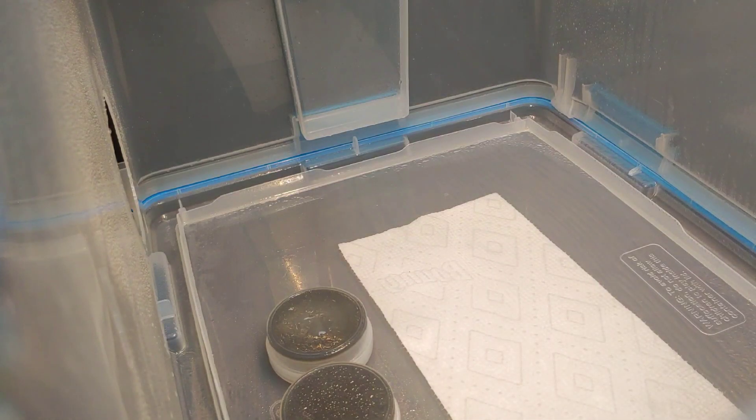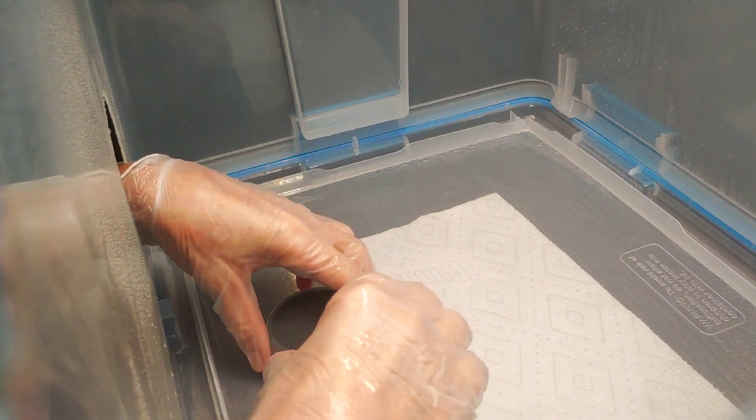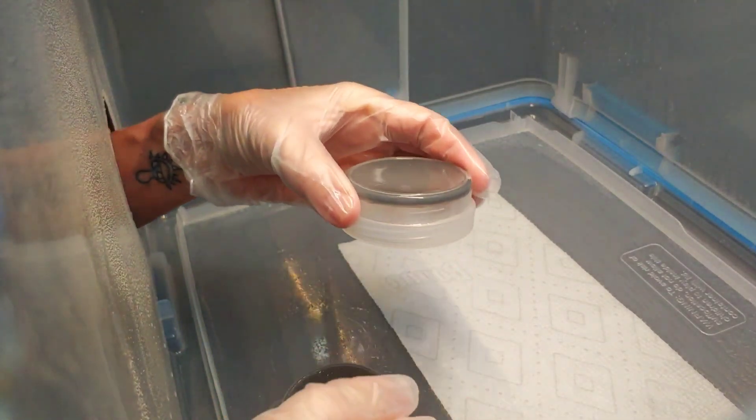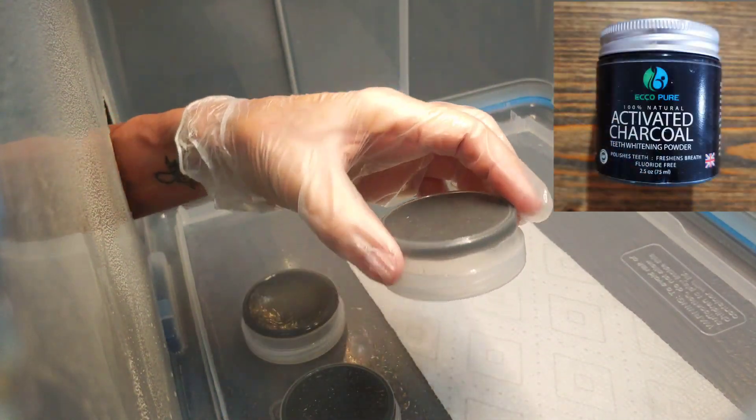We're ready for a new video. I've sanitized my hands, everything's been sprayed in there a few times. These are some new agar cups that I made — I used activated charcoal.